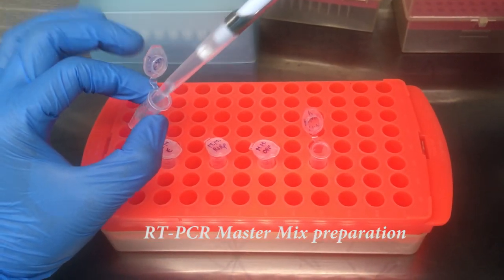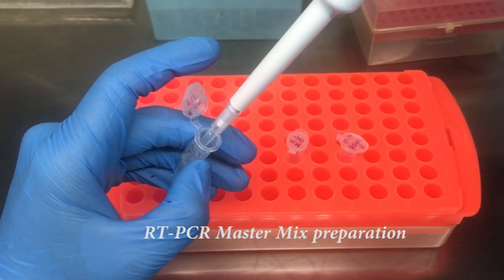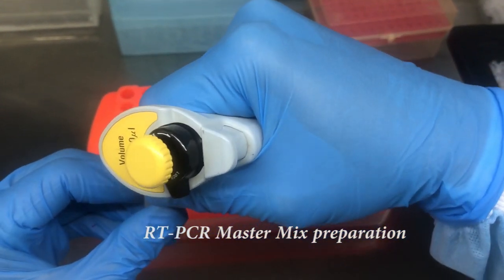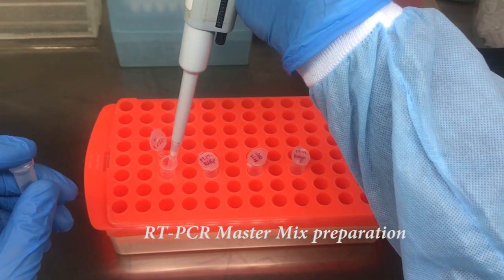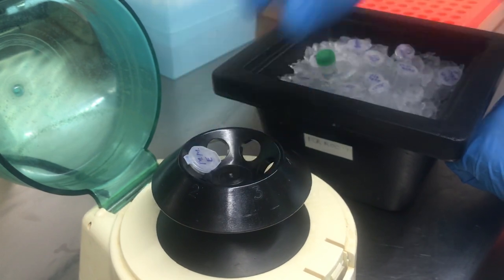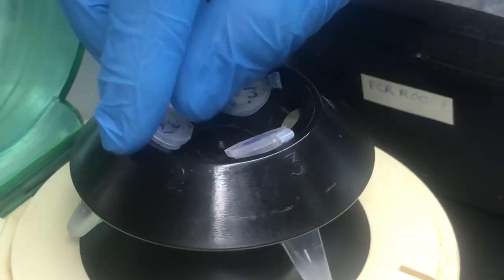After purging the biosafety cabinet, reagents and consumables such as a fresh tube of nuclease-free water, primer probe mix for 4 targets such as E gene, RDRP, ORF1B, and an internal control RNase-P, buffer and enzyme, all maintaining the cold chain by keeping on ice or inside a mini cooler, will be taken out. Calculate the number of reactions based on the sample numbers along with one NTC and one PC for each target.